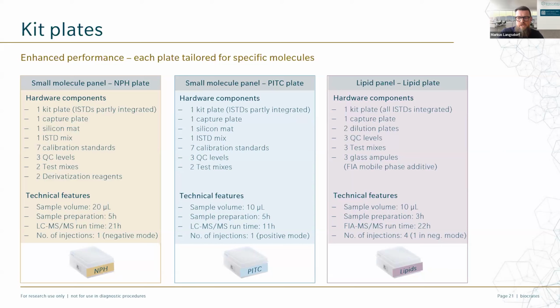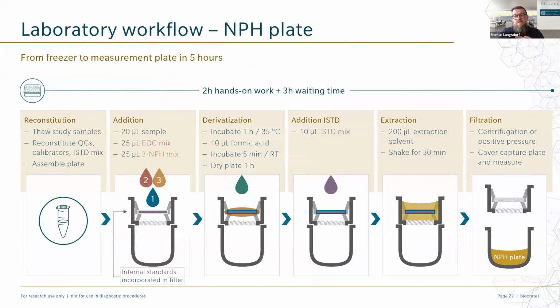The sample preparation time and run time I will resolve a bit later on a separate slide. With this slide, I want to give you some insights into the workflow. So I picked one plate now, the NPH plate, as an example to give you an idea about the workflow in the laboratory. So, of course, it starts with thawing the samples and reconstituting the QCs, the calibrators, and the internal standard mix.